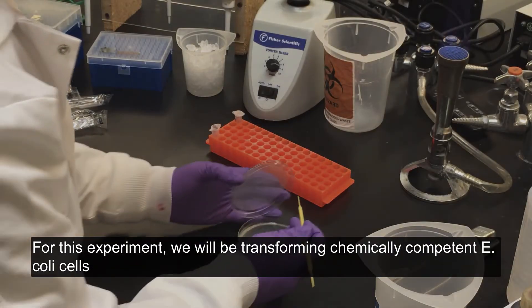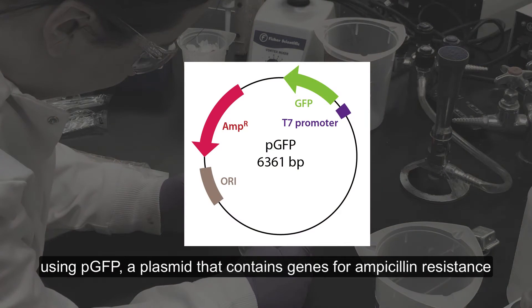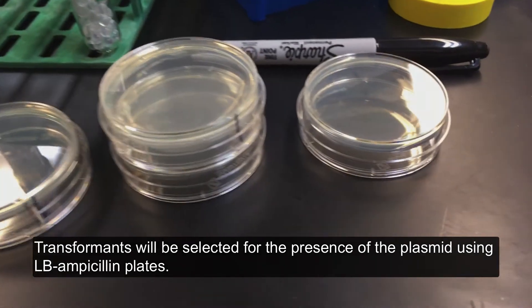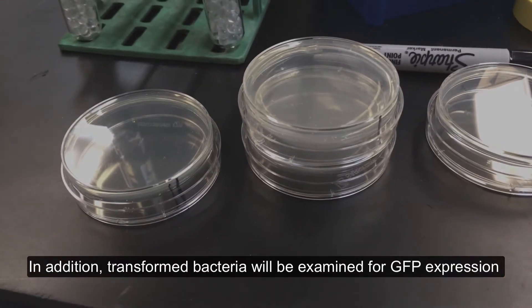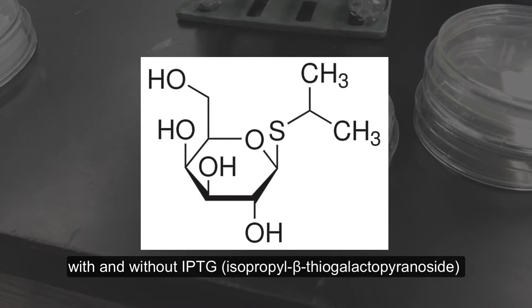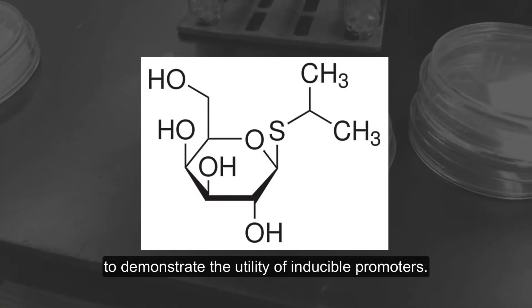For this experiment, we will be transforming chemically-competent E. coli cells using PGFP, a plasmid that contains genes for ampicillin resistance and green fluorescent protein. Transformants will be selected for the presence of the plasmid using LB ampicillin plates. In addition, transformed bacteria will be examined for GFP expression with and without IPTG, isopropyl-beta-thiogalactopyrinicide, to demonstrate the utility of inducible promoters.